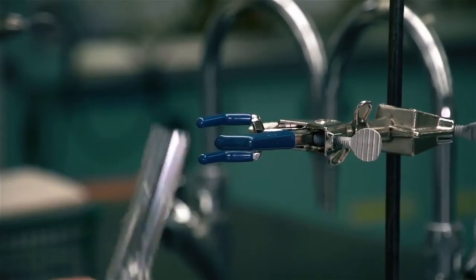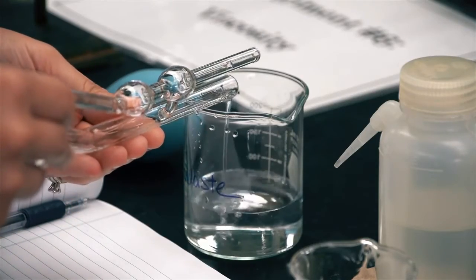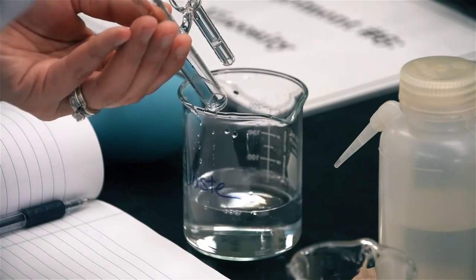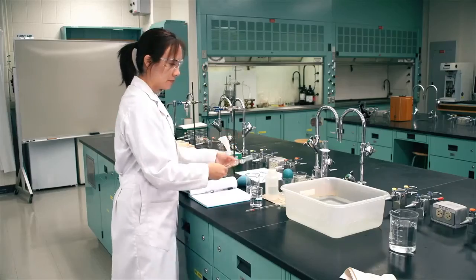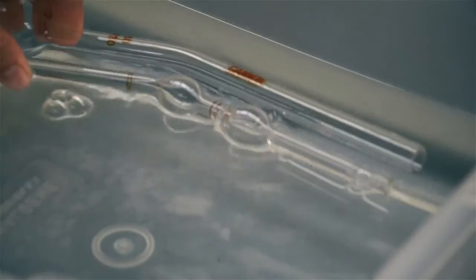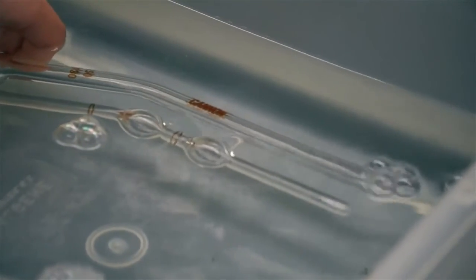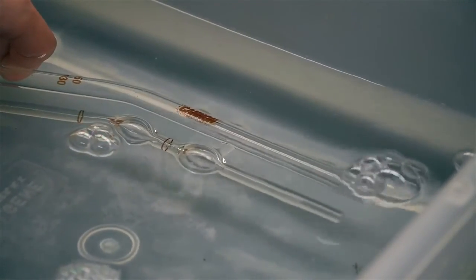Dispose of the sample into the appropriate waste container. Always rinse the viscometer with the solution whose flow time will be measured next. Remember to determine the flow time of the reference liquid. Put the viscometer into the cleaning bath at the end of the experiment. Make sure the soap solution fills the viscometer.